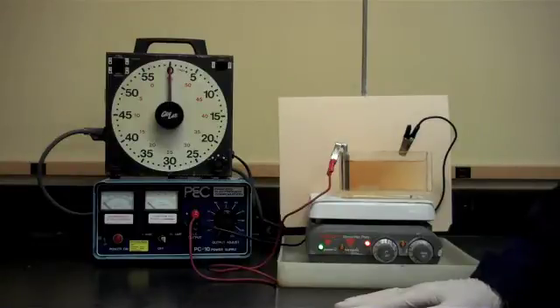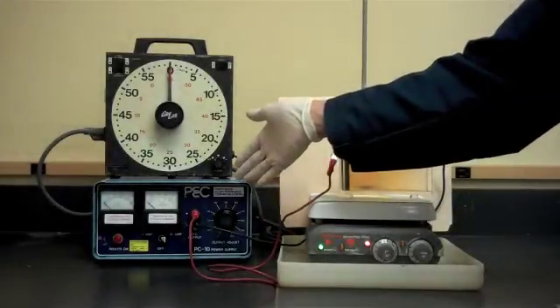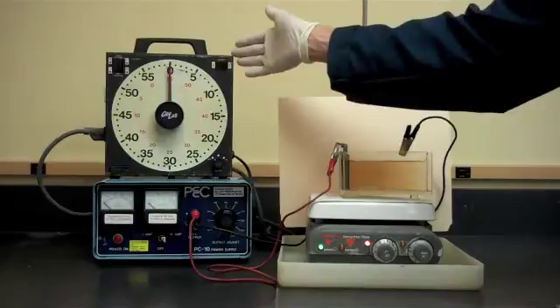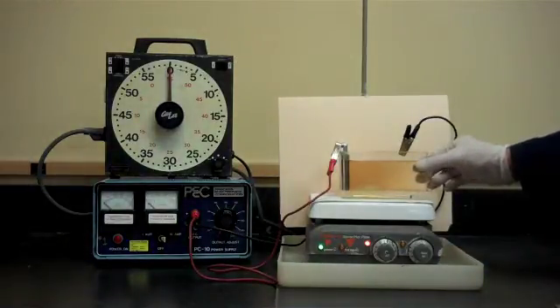The test usually uses a power unit which supplies direct current, a timer, a magnetic stirrer, and the Hull Cell container itself.